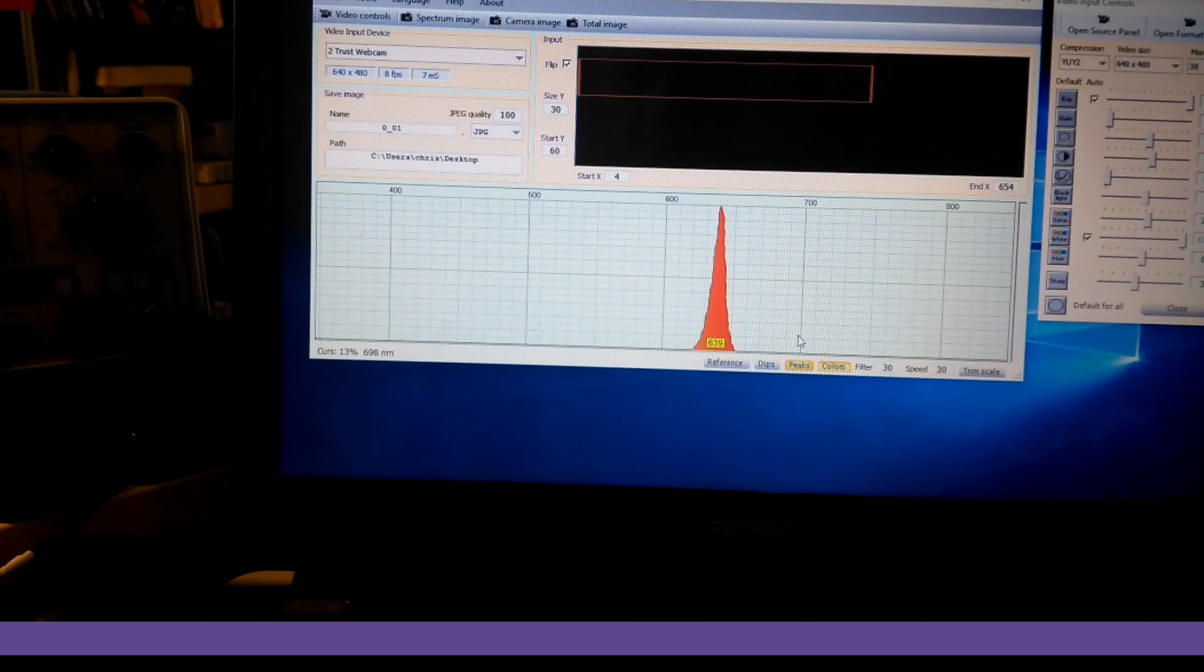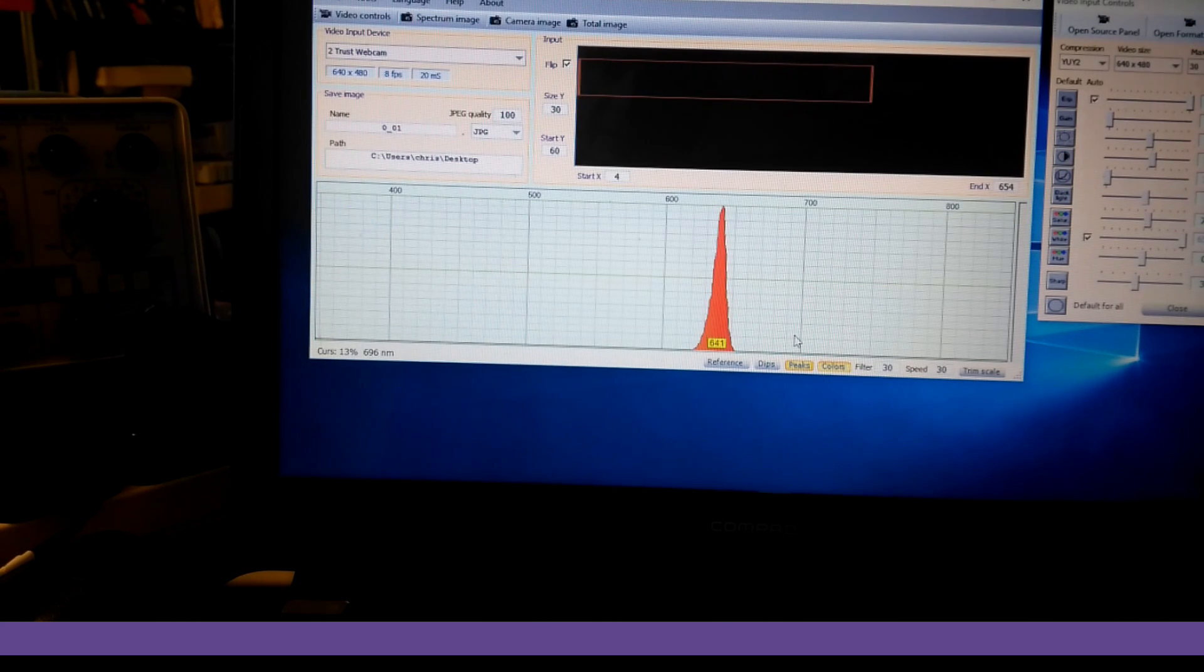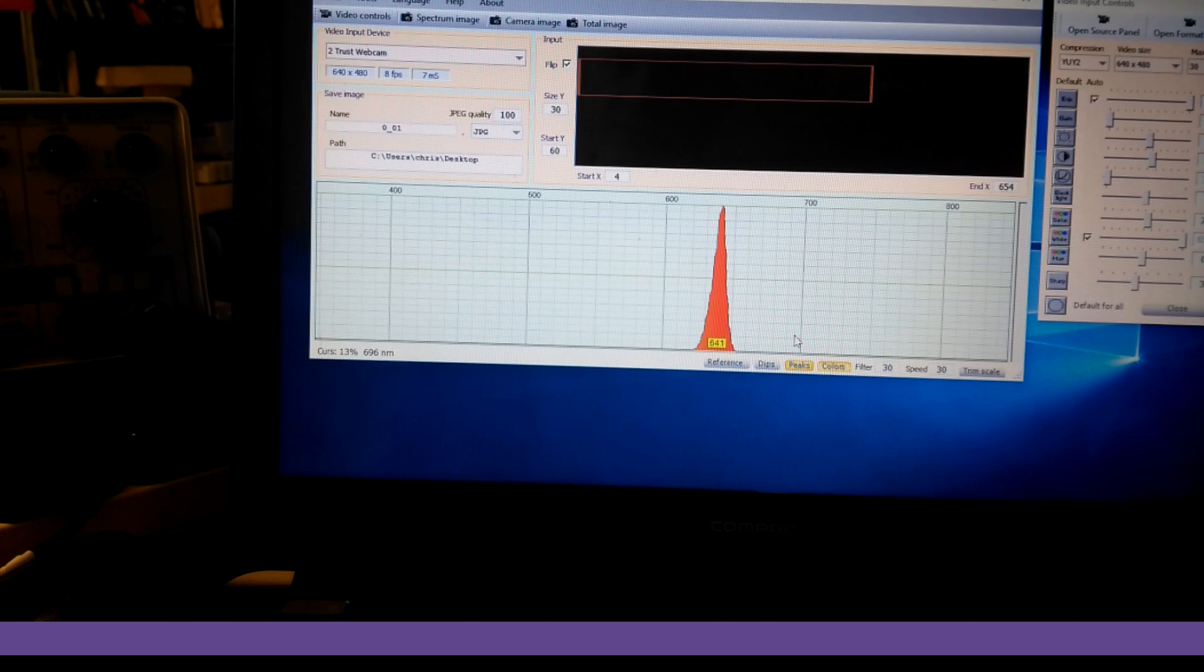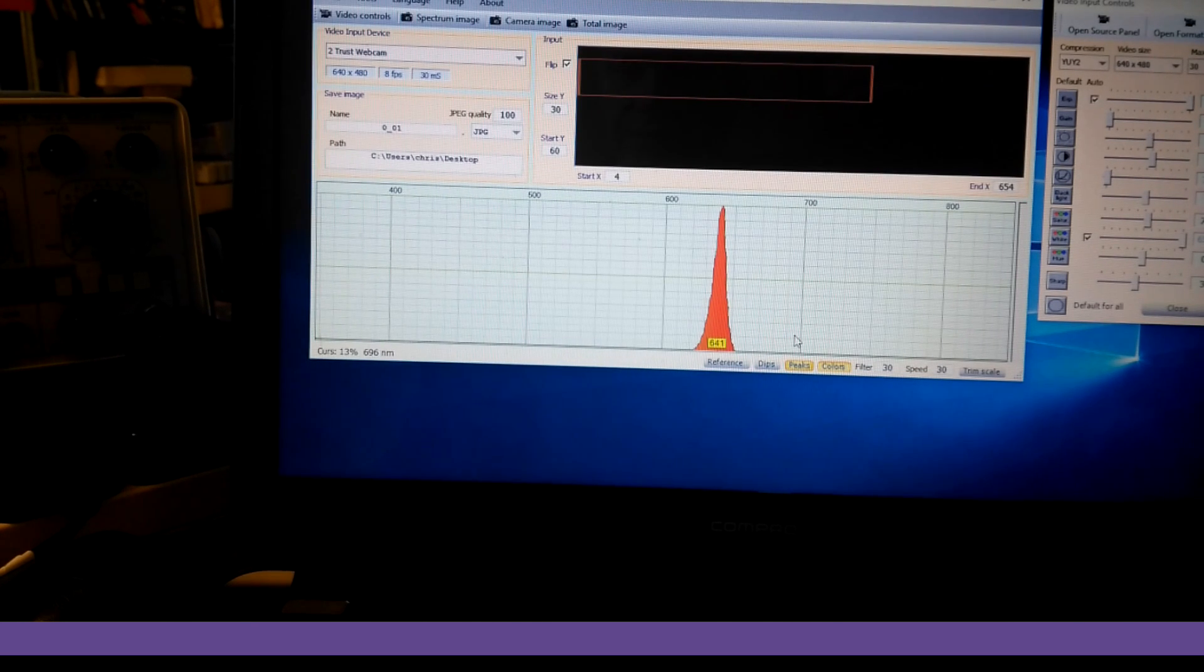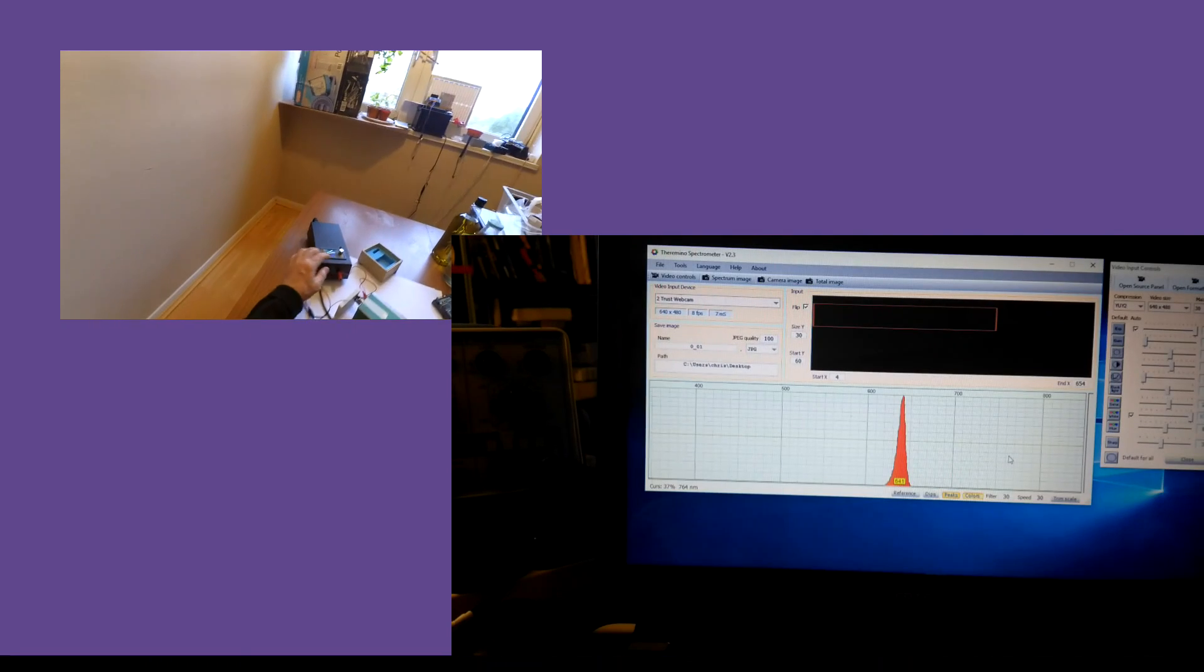639. So that laser, according to this spectrometer, is transmitting at 639 nanometers, which is interesting. Okay, so turn that off.